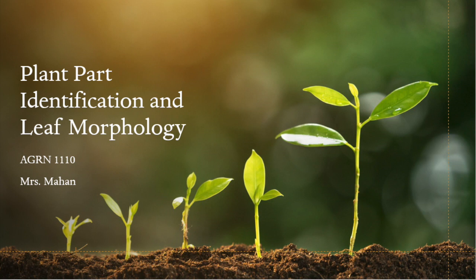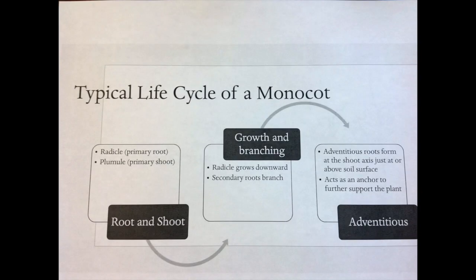Hi everybody, so today we're going to do our plant part identification and leaf morphology lab activity. So this is to reinforce the typical life cycle of a monocot.